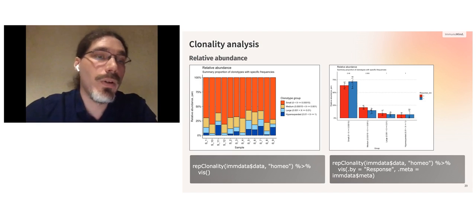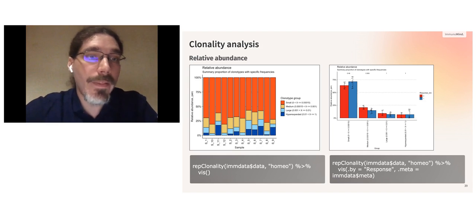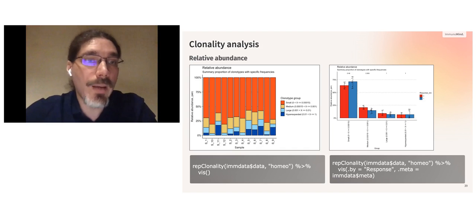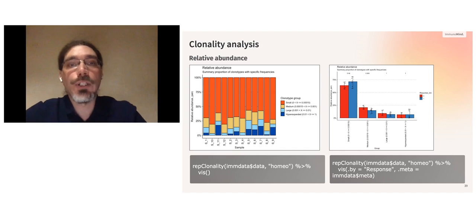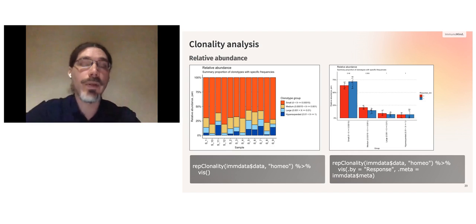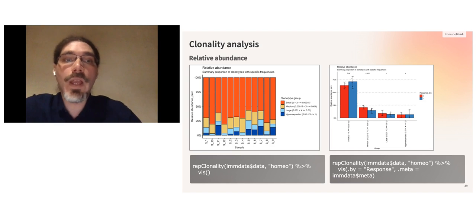The second group, let's call them medium clonotypes, occupy the second set of abundances, and so on. So if you have some idea of how clonotype abundances in your domain look, you can create these groups and look at the specific group you are interested in.